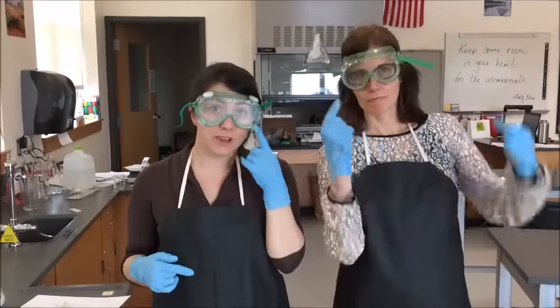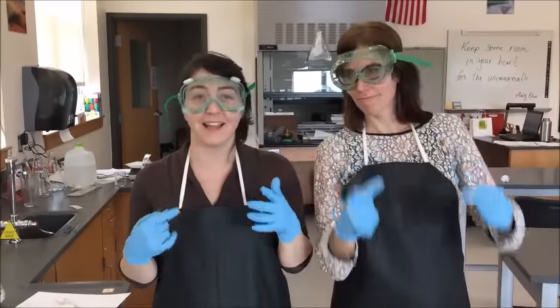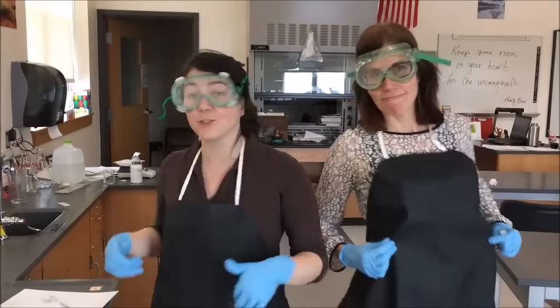Before you do any work with your DNA, you want to make sure that you're wearing the proper equipment. You need to have your goggles on your face covering your eyes. You want to make sure that you have your gloves on and that you have an apron, and it should be tied in the back.